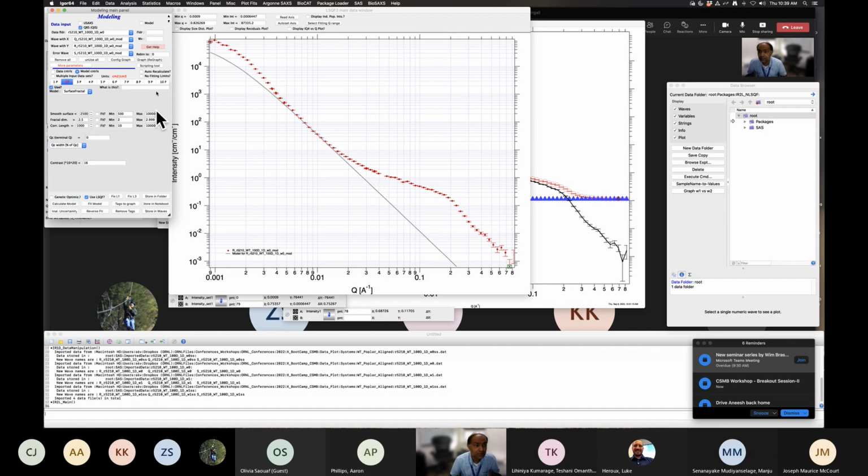It sort of gives you there, but maybe 2000 is too much. Oh, if you click on this right below the blue line here, auto recalculate, then I don't need to keep pressing calculate. So calculate automatically. So you can see it's sort of leveling off here. We can try that, but we need to move it up a bit. So 3,500. No. How about 7,500? There you go.